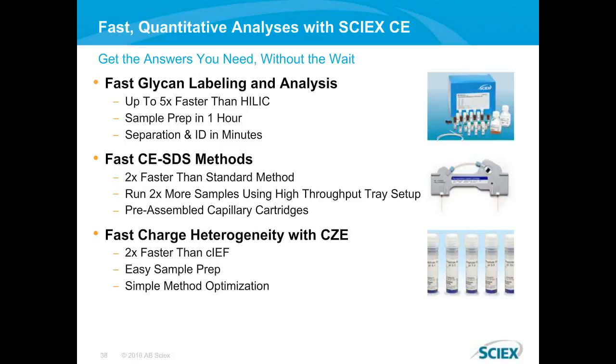And our next question is, what kind of capillaries are used for N-Glycan separation? Are they standard bare fused silica or coated? Right. So in the original assay that we currently have on the market, the oligosaccharide labeling and analysis kit, we recommend using the N-CHO capillary, which is essentially a PVA-coated capillary, which really helps in minimizing electroosmotic flow and interaction of any analyte with the wall of the capillary itself.